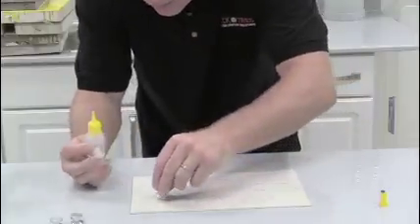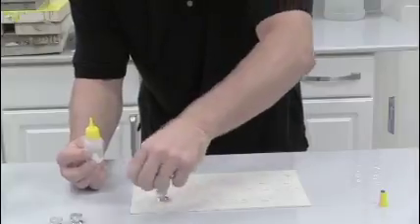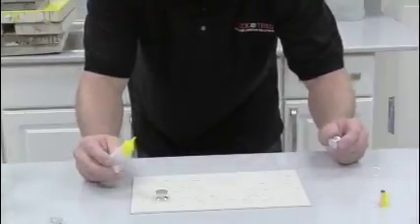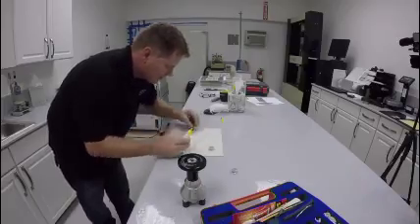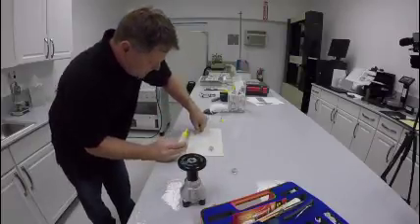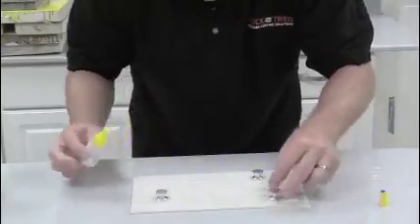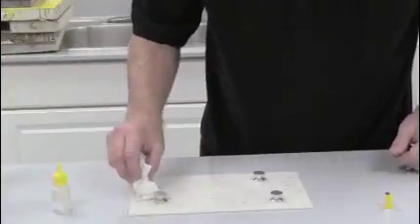I'm going to put down some adhesive here. What you want to do is make sure you clean off with a Q-tip around this edge — which I'll do in a minute — just to make sure that the glue doesn't give us a false reading. I'm just going to clean up these edges to get the glue off.